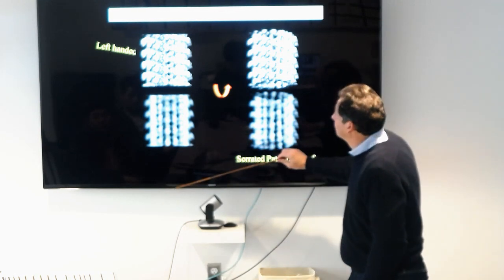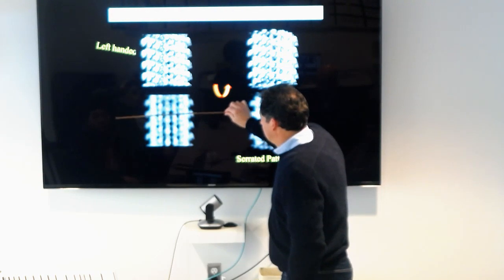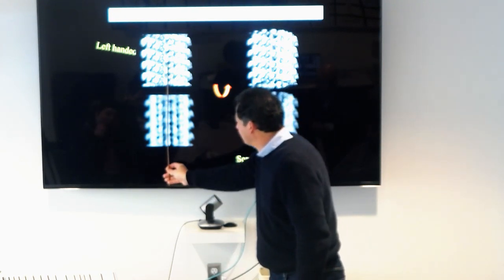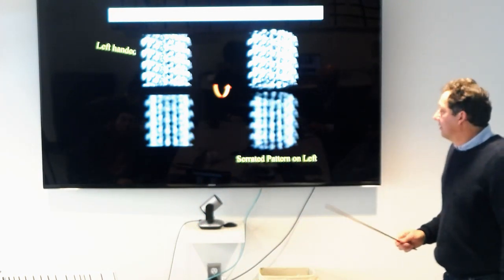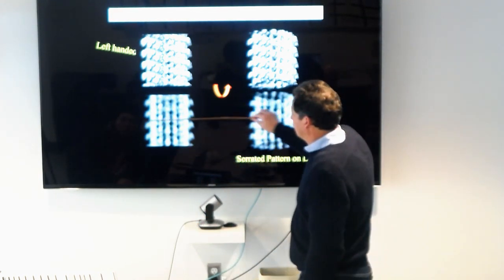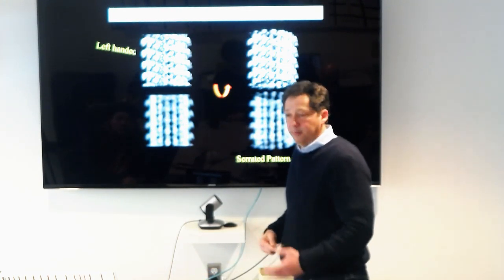What else do you know? You know that if I trace a line here, okay, in this case it's not that clear, but you will see that it's not exactly centrosymmetric. So it will have to be, and no, actually this is centrosymmetric, you see it here, so that will correspond to an even Bessel order.